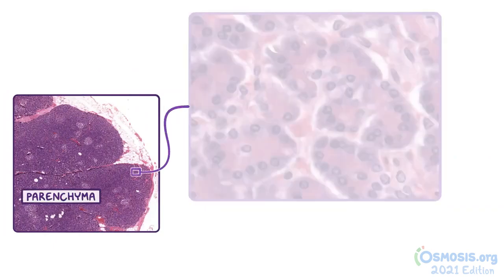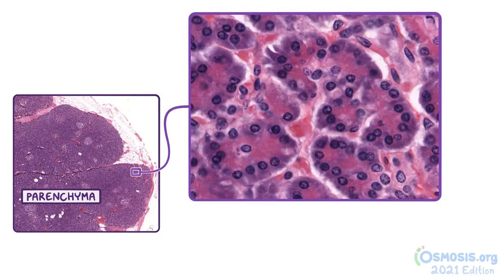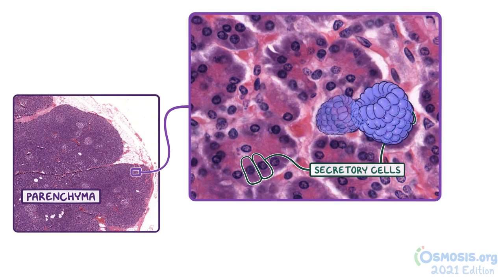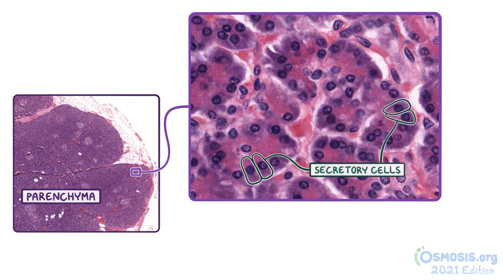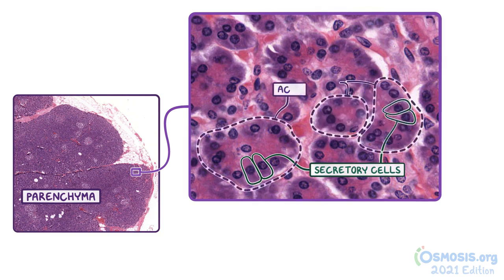The main functional tissue of the pancreas is called the parenchyma. If we take a closer look at this slide stained with hematoxylin and eosin, or H&E for short, we can see that the majority of the parenchyma consists of the exocrine portion of the pancreas. The exocrine secretory cells are arranged in groups that resemble a berry surrounding a central lumen. In Latin, acini means berries, which is why the groups of exocrine cells are called acini.